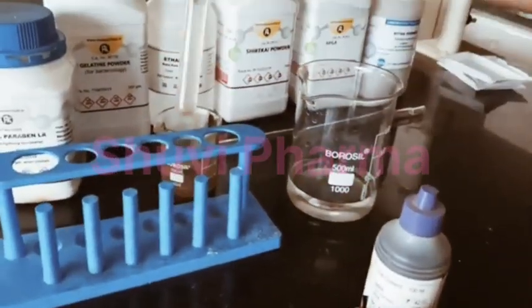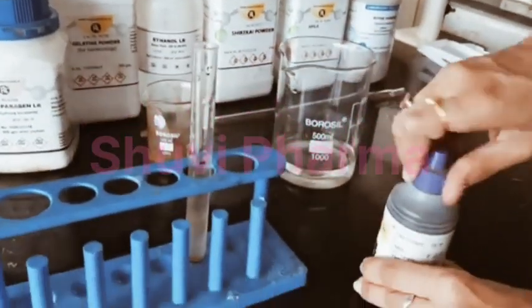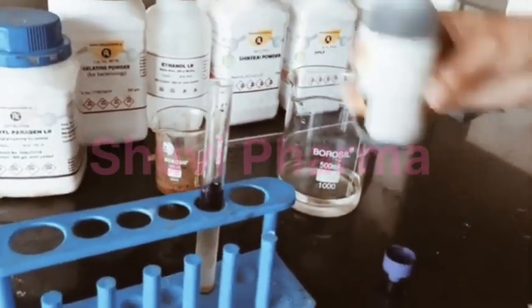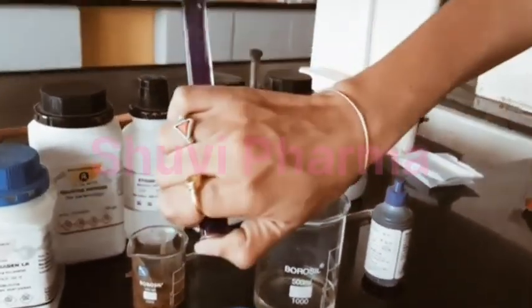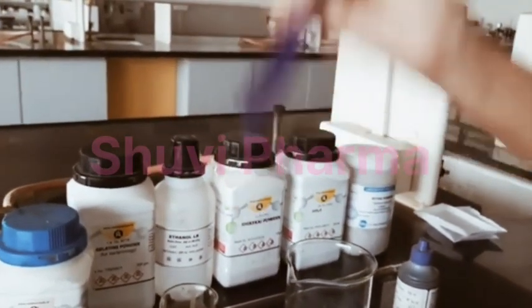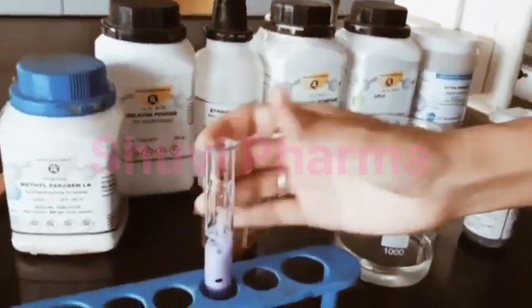Now I have added 2 drops of shampoo in 10 ml of water. To this we will add ink, 1 drop of ink. Now we will shake this 10 times. And wait for 5 minutes.